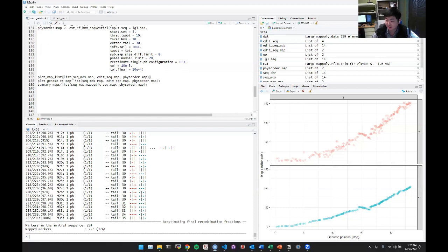There's a question in the chat that says, if there are some problematic SNPs that we don't have the reference genomic order info for, could plots like this help show the location? If so, how? You could use plots like this. You would have to map using an MDS method. And if you do the mapping and you do clustering all with MDS, it should tell you which chromosomes they belong to and where on the chromosomes. But you would have to use MDS, and then from there you can manipulate things and assign a putative position, and then remap it again. And it'd have to be a lot of iterations.